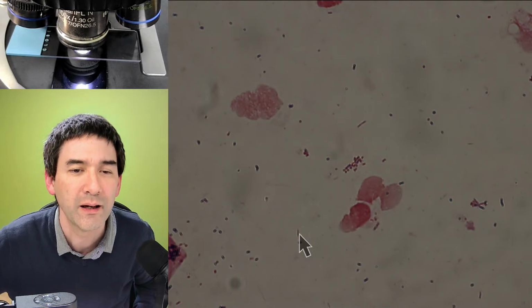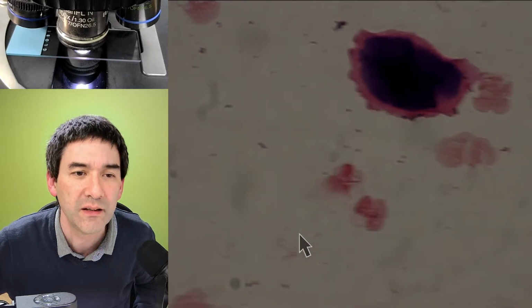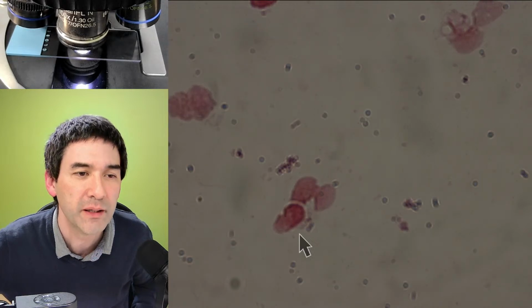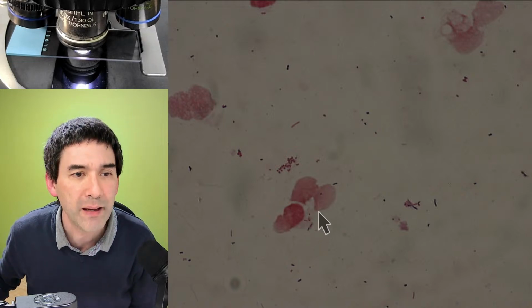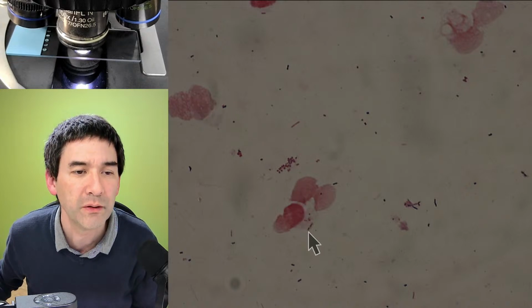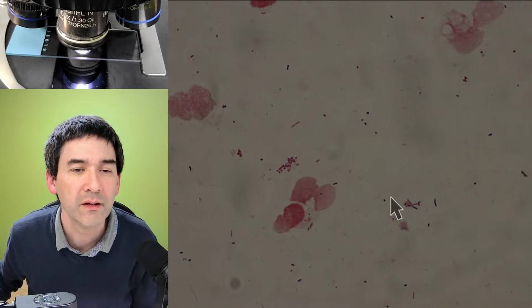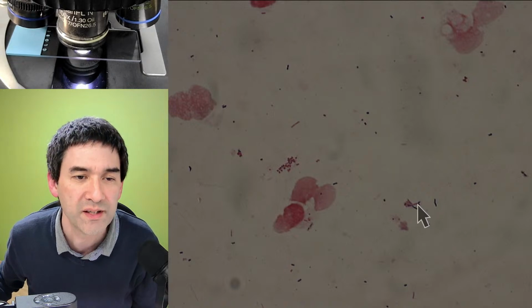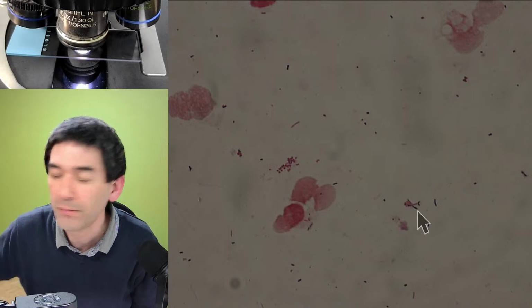So I'm going to explain. Beautiful. This is actually better than I thought. Here it did not completely destain. Look, very nice. Okay, I need to explain this to you. So those red patches that you see here seem to be the cells of my mouth, but those dark ones over here, do you see those? Bacteria. Over here especially, you can see that the gram-positive ones stain darker, and now we're able to see them, and we were not able to see them before, right?